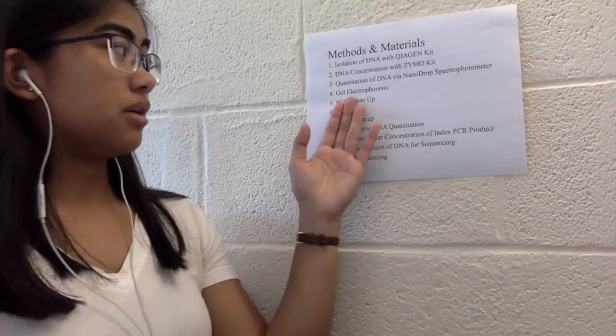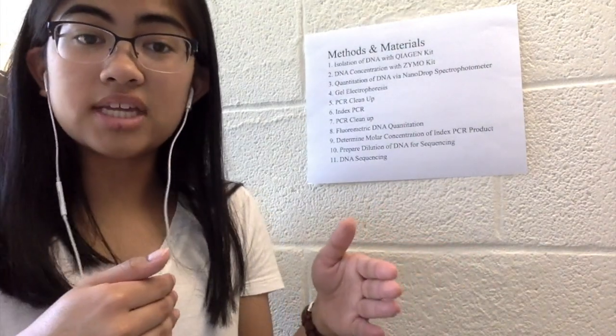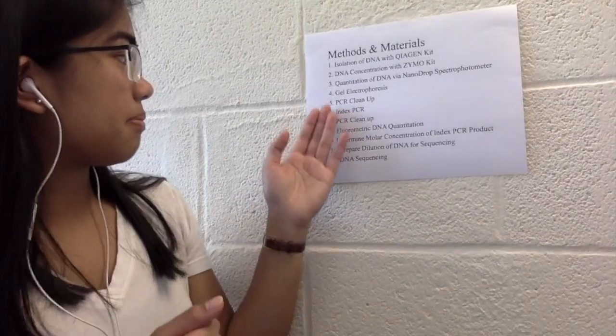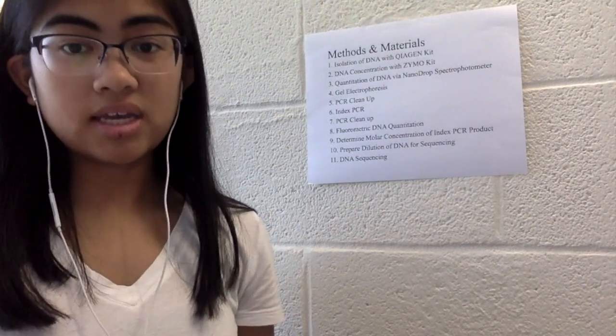Step 4 is the gel electrophoresis, which is used to separate the DNA fragments by size. The smaller DNA fragments will move further than the large DNA fragments, moving from a negative to a positive side on the gel. Step 5 is the PCR cleanup, where the DNA binds to the beads, and then we use ethanol to remove all of the impurities.